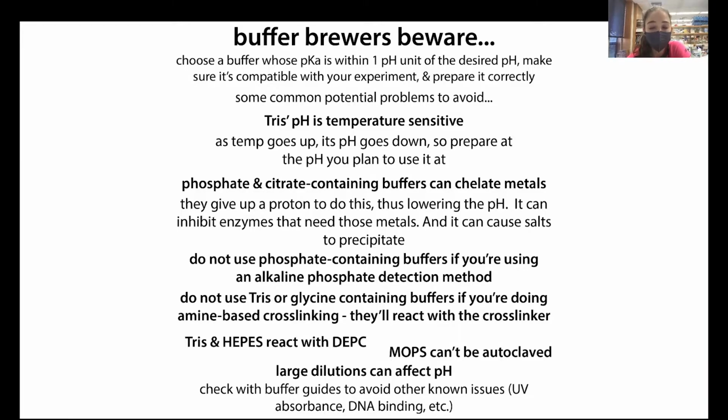When you're choosing a buffer, the most important thing is first you want to find one where the pKa is near your desired pH. But then you also need to make sure that it's not going to be incompatible with your experiments. And you need to make sure you prepare it correctly.